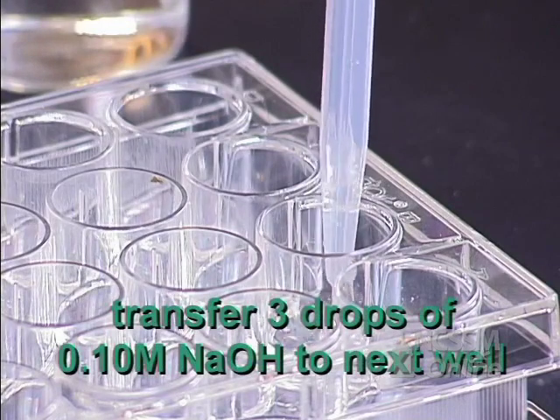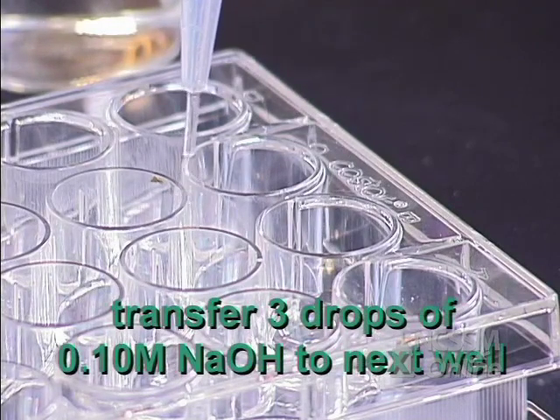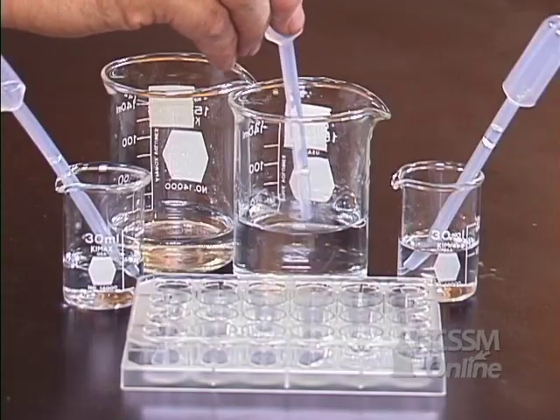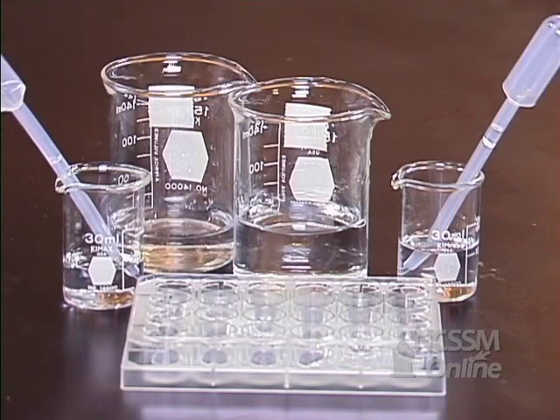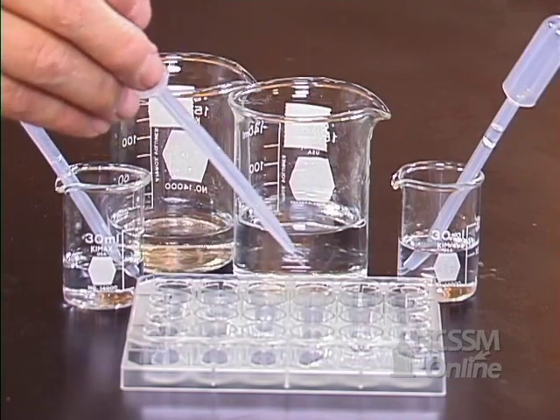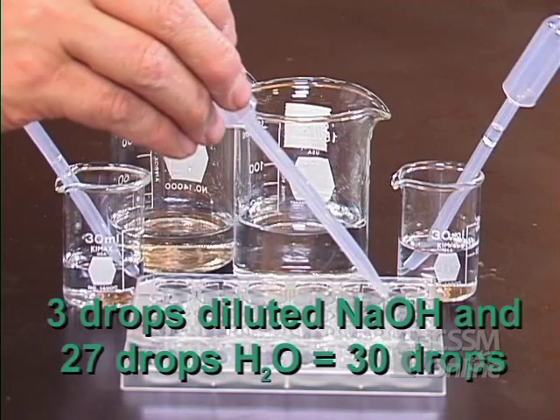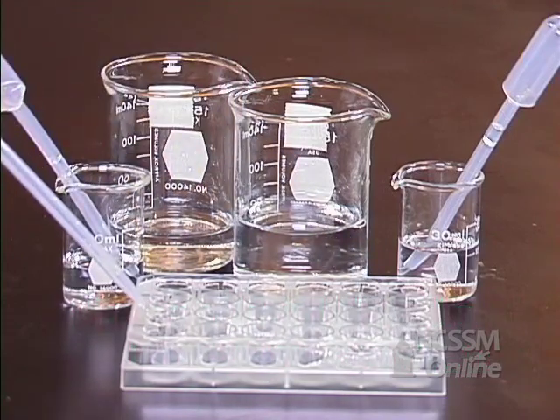Transfer 3 drops of that solution to the next well. Rinse the pipette, then add 27 drops of water and mix. Continue that procedure until you've filled all the wells in that row. This should take you from pH of 13 down to pH of 8.